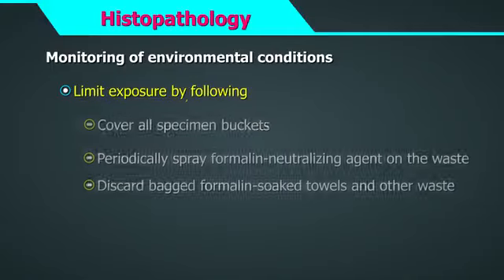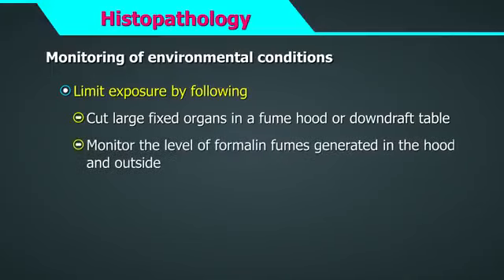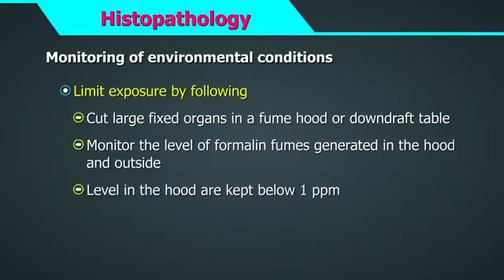pedal. Cut large fixed organs in a fume hood or downdraft table. Monitor the level of formalin fumes generated in the hood and outside by a formalin fume monitoring device, and the levels should be kept below 1 part per million.